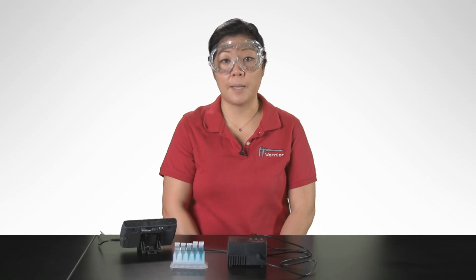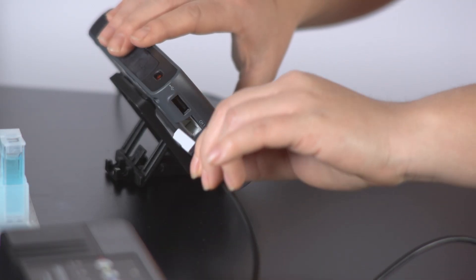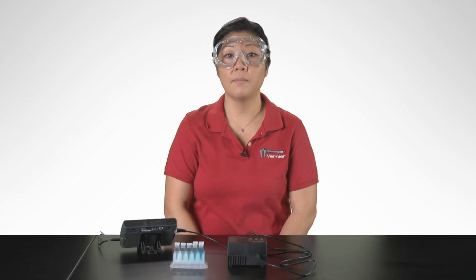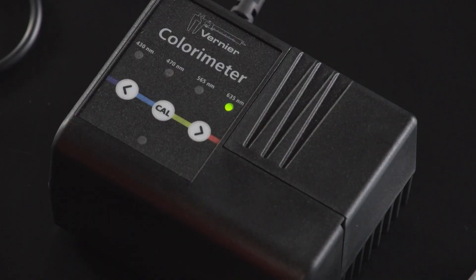To set up and collect data for our Beer's Law Experiment, follow these steps. Connect the colorimeter to LabQuest 2 — the sensor will auto-ID. Select the wavelength for the experiment. This experiment will be using blue food dye, and I'm choosing 635 nanometers.